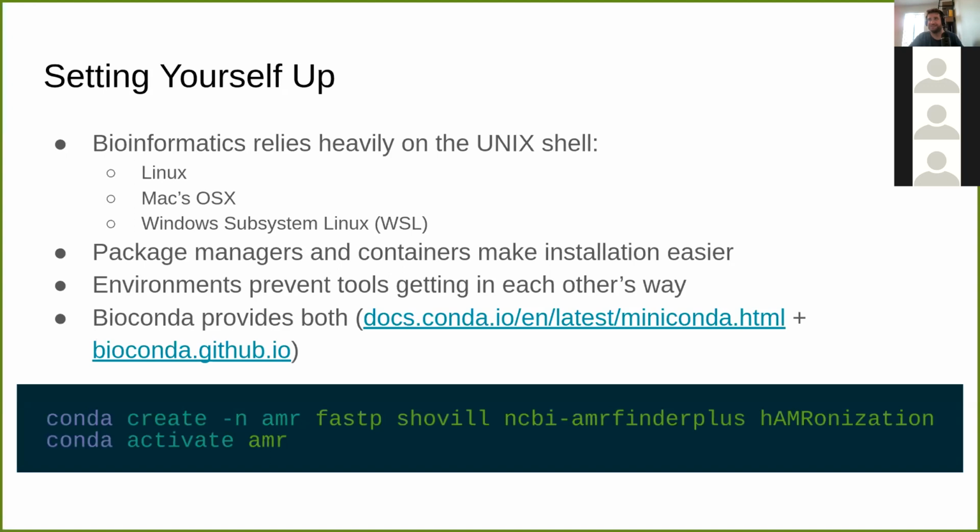And while yes, it is not as nice and friendly as point and click, a lot of bioinformatics is built for us and assumes you know how to do it. There are materials to learn the basics of this, especially Software Carpentry materials, linked in that repository. So if you want to learn more about how you open and navigate a shell, and how you deal with all that, jump in there.